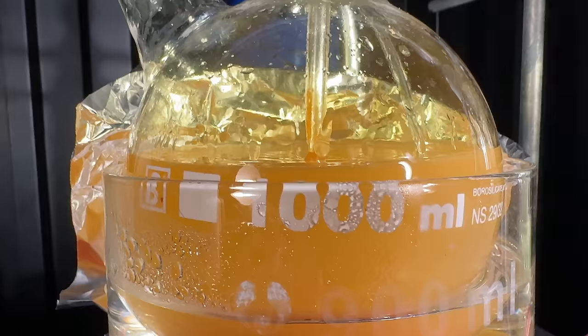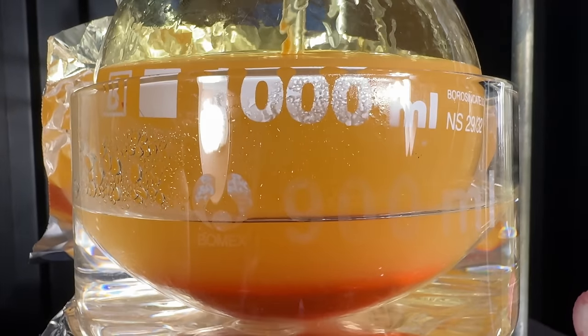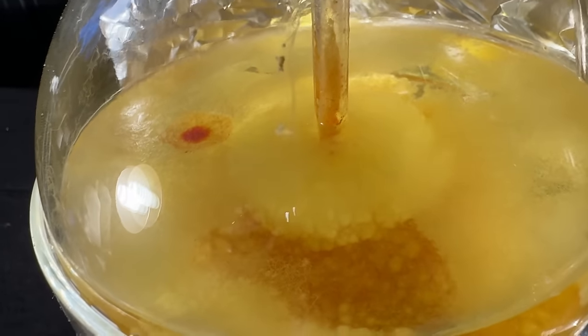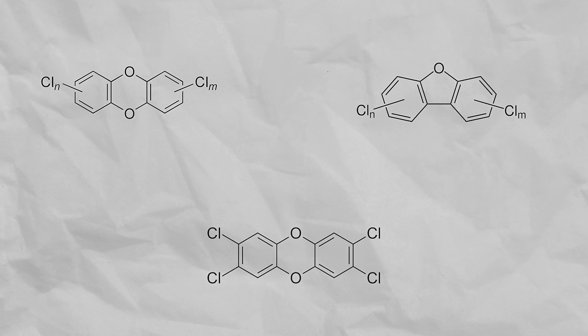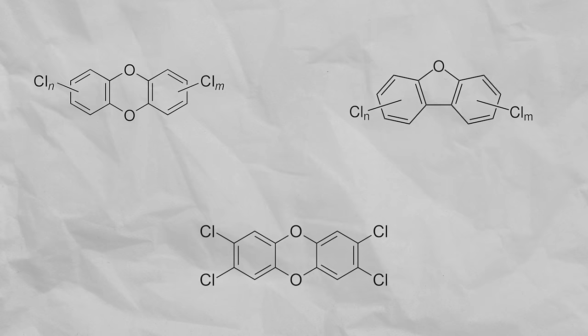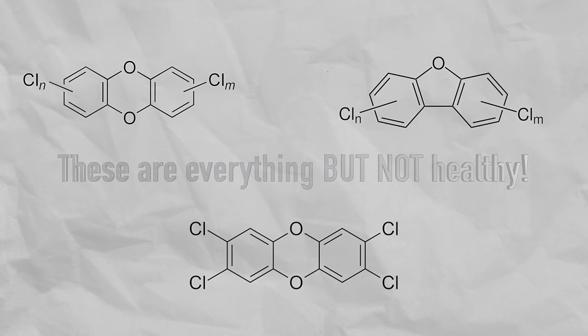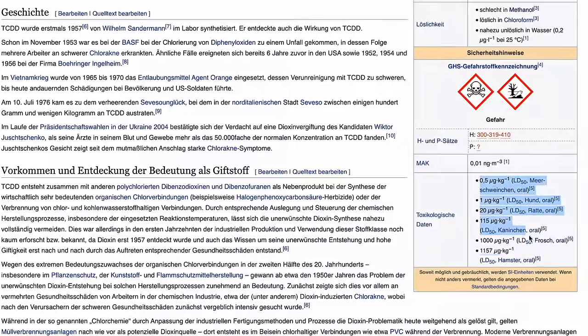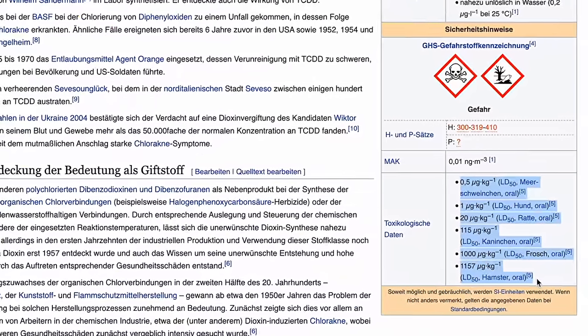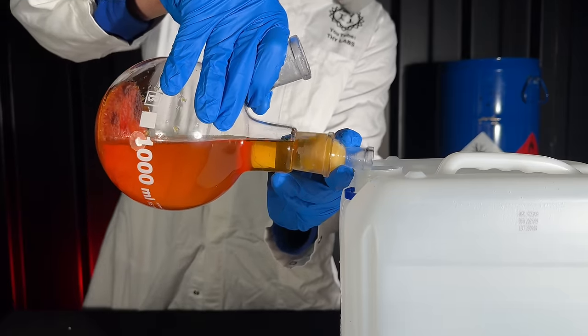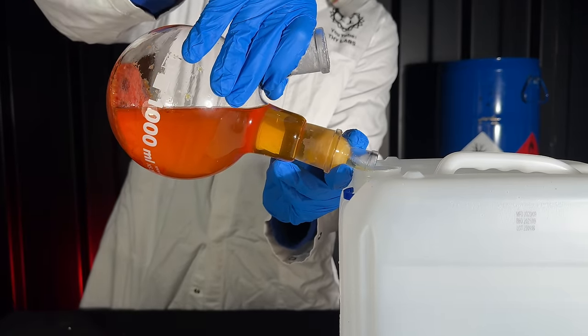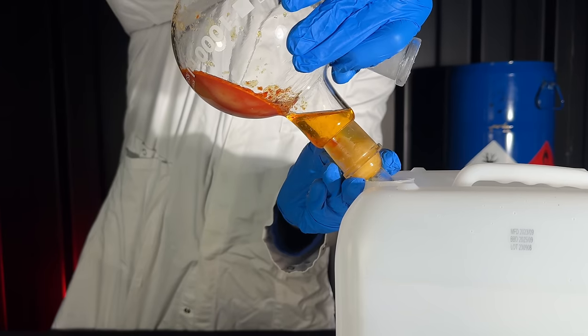After 10 hours I stopped the chlorination as the glass tube clogged up. While cooling, these crystals formed. The next day I continued with the chlorination as this TLC showed two spots instead of one. Careful temperature control is crucial during the chlorination. If I heated up too much, I could end up with unprecedented amounts of polychlorinated dibenzodioxins and dibenzofurans. These chemicals are highly toxic, carcinogenic and you want to avoid making them at all cost. The chlorination ended up taking a little over 26 hours.